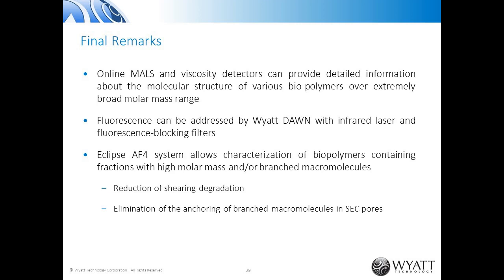I also tested. So generally, except for DMSO that would dissolve the semi-permeable membrane of the channel, you can use most of the organic solvents. As I already said, all aqueous buffers.